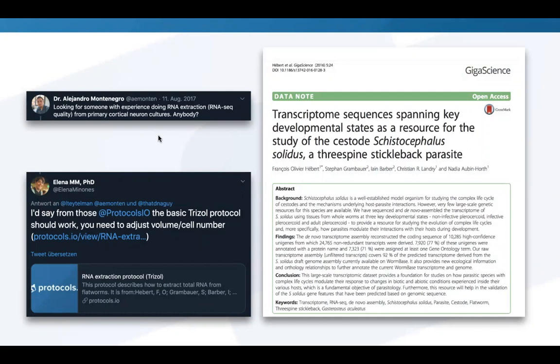So it's really exciting to see that if all the protocols are in one central repository, you might also enable somebody who's not directly from your field to use methods in a different way. Or you might discover things that you might not have discovered in any other way.